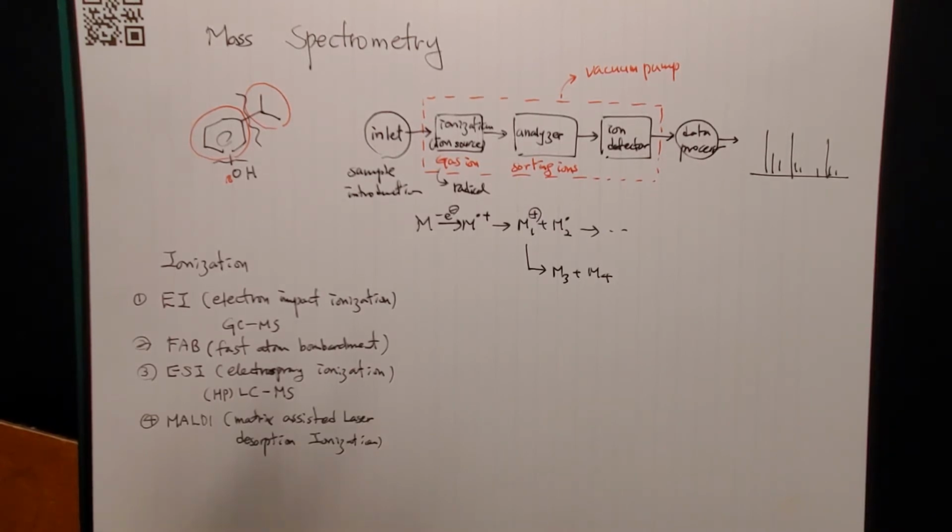And next is MALDI, matrix assisted laser desorption ionization. Basically you have multiple samples on a little plate with many wells. Then you blast the sample with a laser and ionize it. The samples are mixed with other chemicals that can absorb the laser energy better, helping transfer energy to the sample more effectively.